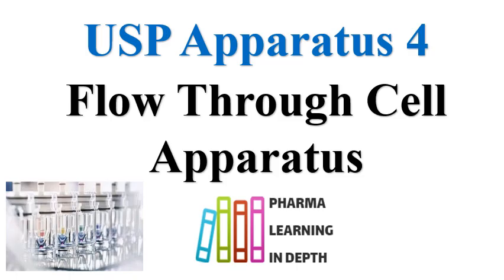Depending on the formulation and the in vivo, in vitro correlation requirements, different apparatus can be used. So the USP 4 apparatus has some merits and advantages for some complex formulations. I hope this video will help you understand the USP 4 apparatus.